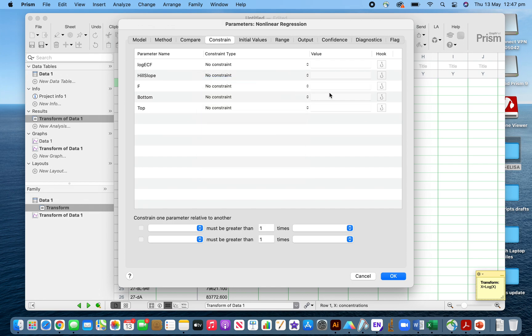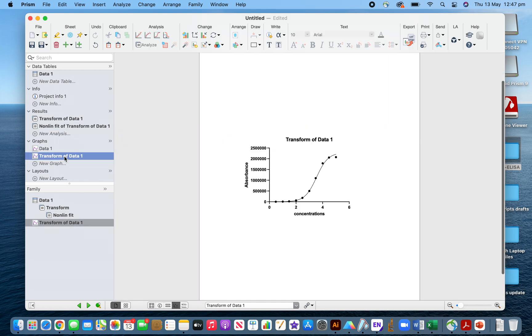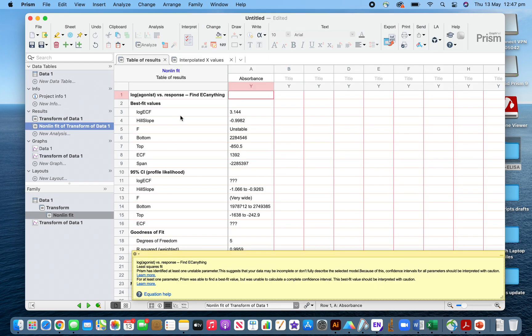If the bottom is present, you have to transform these into no constraints, otherwise you have to put the bottom here. It's always better to make it no constraints. Now if you click OK, then check the graph here.